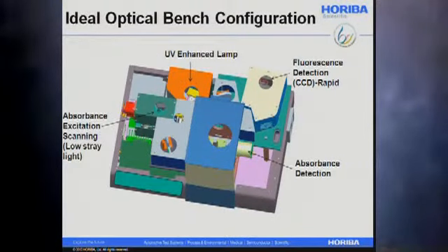And so typically, our optical bench here comprises a light source, a monochromator that scans the exciting light that the sample sees, and we do a sample and a blank comparison, but there's an absorption transmission path and a reference detector that corrects for changes in the lamp intensity. So you can make very long-term studies. It's fully corrected for the lamp intensity and changes in the lamp intensity.